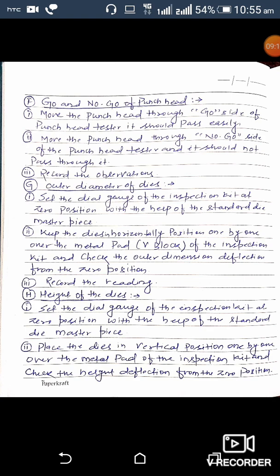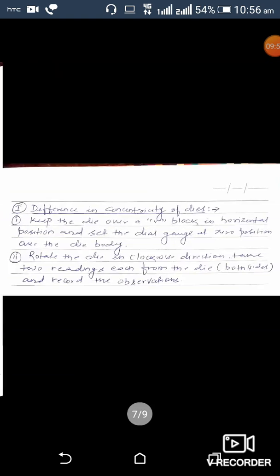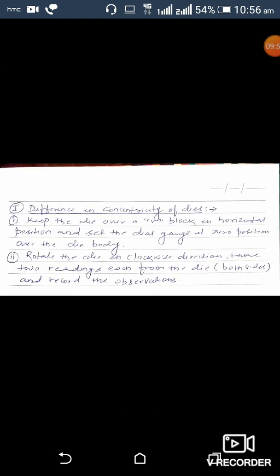To check the outer diameter of the dies, set the dial gauge at zero using the standard die masterpiece, keep the dies horizontally one by one over the metal pad of the inspection kit, and check the outer diameter deflection from zero. To check die height, set the dial gauge at zero using the standard die masterpiece, place the dies vertically one by one, and check height deflection. To check concentricity of the dies, keep the die over a V-block horizontally, set the dial gauge at zero over the die body, rotate clockwise, take two readings, and record.